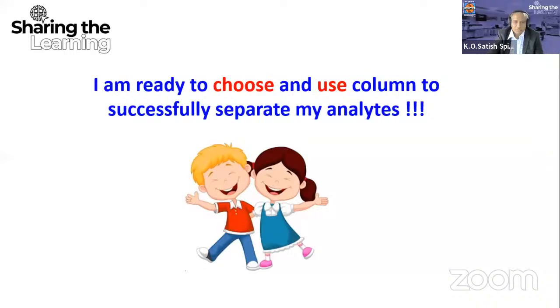Another question from Pooja again. What is the best regeneration method for C18 columns in stationary phase? There is a 10-step procedure available in troubleshooting. Probably in one of our coming seminars, we will be giving a separate talk on troubleshooting HPLC and MS. At that point in time, probably we will cover this topic.